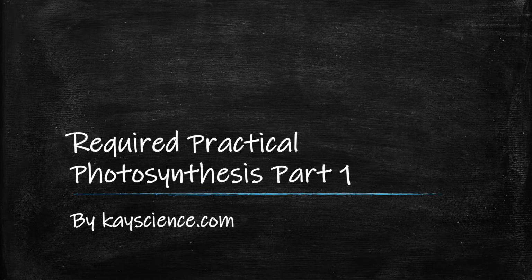Photosynthesis Required Practical Part 1 by KayScience.com. In this required practical, we're going to investigate the effect of light intensity on the rate of photosynthesis.